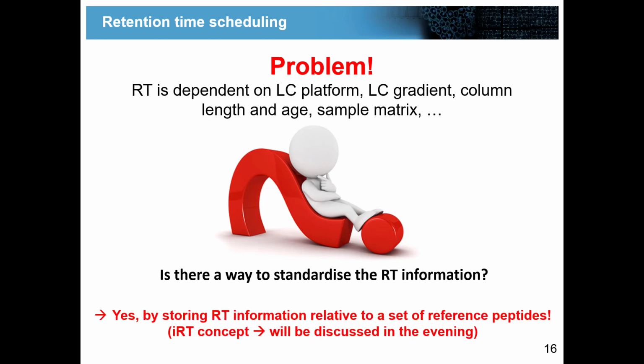And that's what was also already mentioned by Sue a few times: people achieve the standardization of retention time information by storing retention time information not in the unit minutes on my system, but they rather make retention relative to a set of reference peptides. And as long as we work with the same reference peptides, we can immediately correlate and calculate retention time between systems. And this is also what we will refer to as the iRT concept. And there will be a whole hands-on session and a whole lecture for you given by Lindsay, who will explain you all of that in detail and how it works in Skyline.